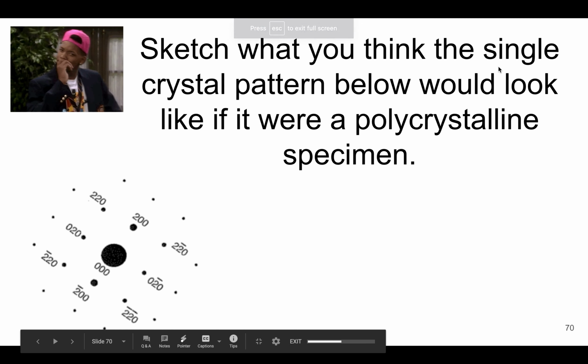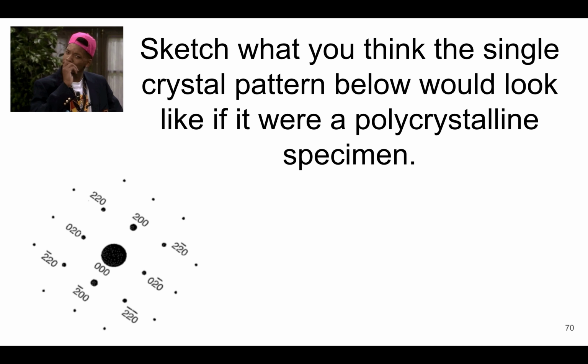All right. So in this module, I want to divert a little bit and talk about what polycrystalline samples are like when we're doing diffraction studies in TEM. So again, I want to kind of open with a question.